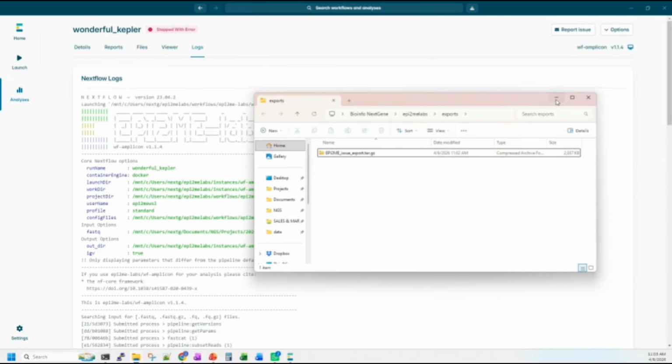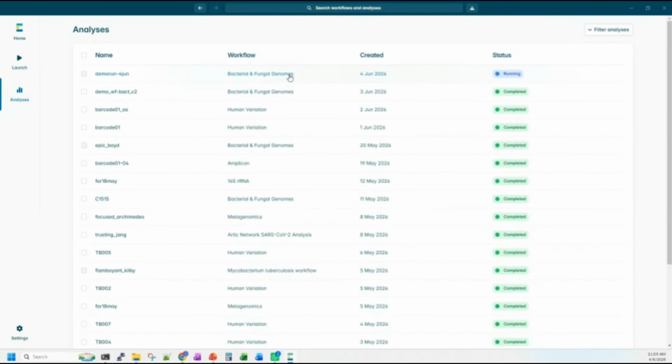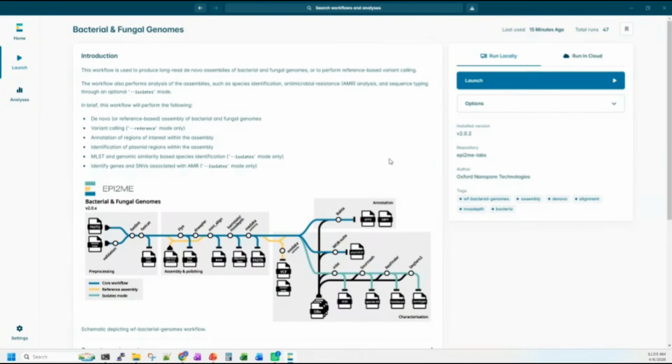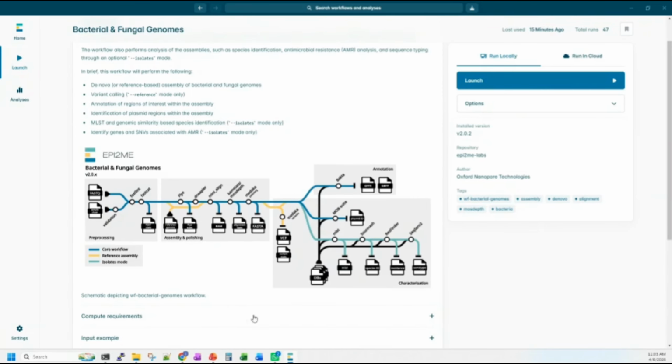So basically, this is how we carry out the analysis using Epi2me, particularly for bacterial genomes or microbial genomes. This particular workflow at the moment can help to do the bacterial genome assembly and all the further steps. If we look into this map, somebody said it looks like our MRT map.